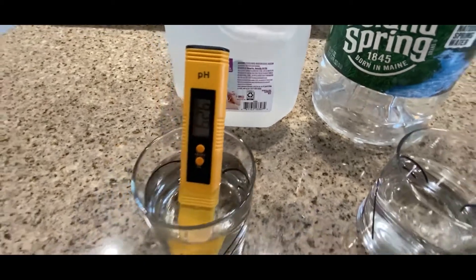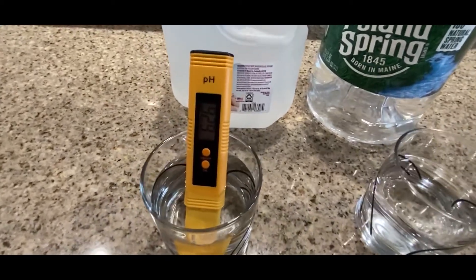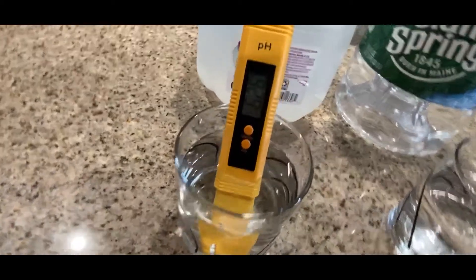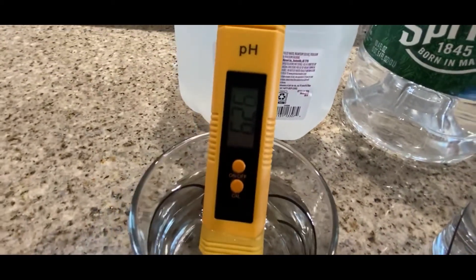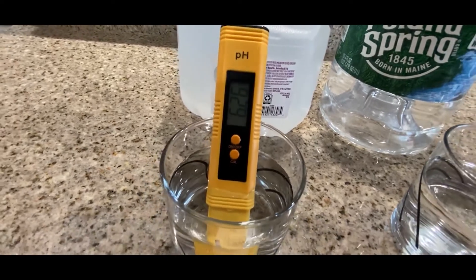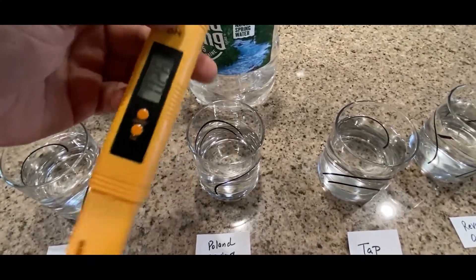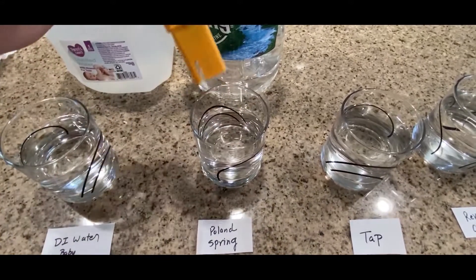The first pH reading is DI water — Baby DI water — and it comes out to be 6.26. According to what I found online, it should be between 6.5 and 8.5, so it's a little bit on the low side, but I guess it's not that bad.